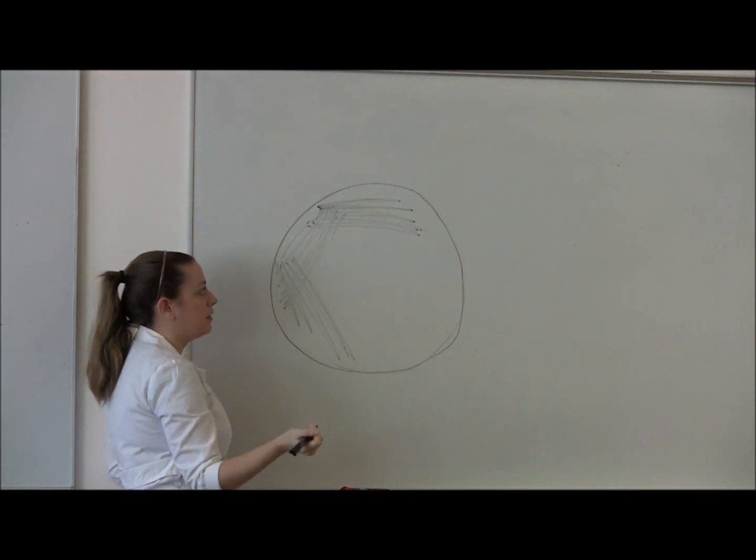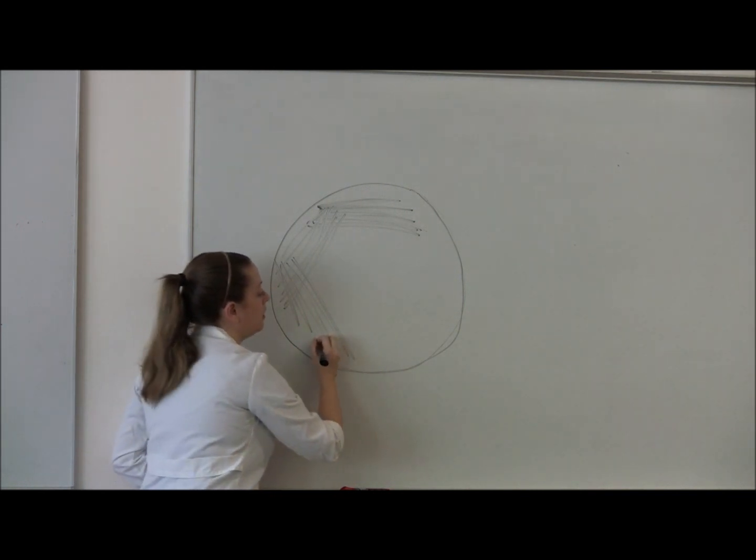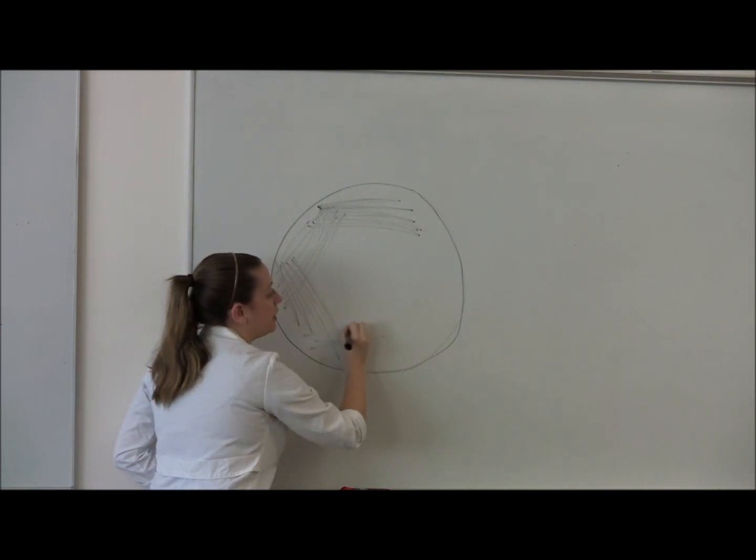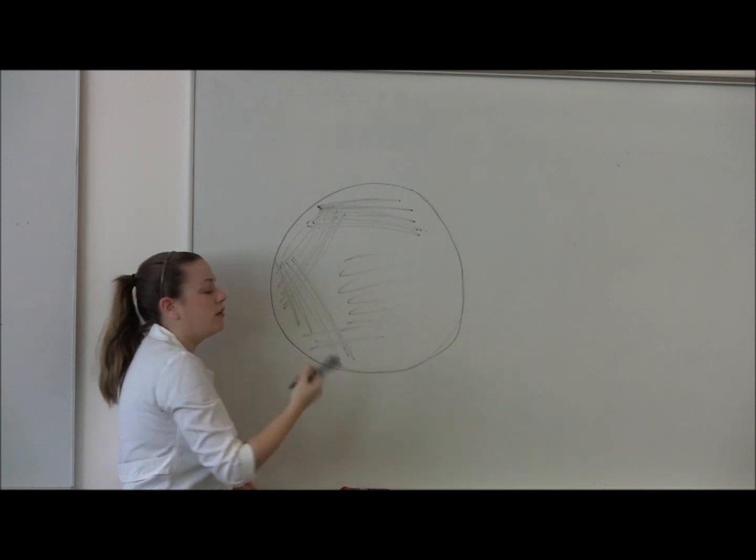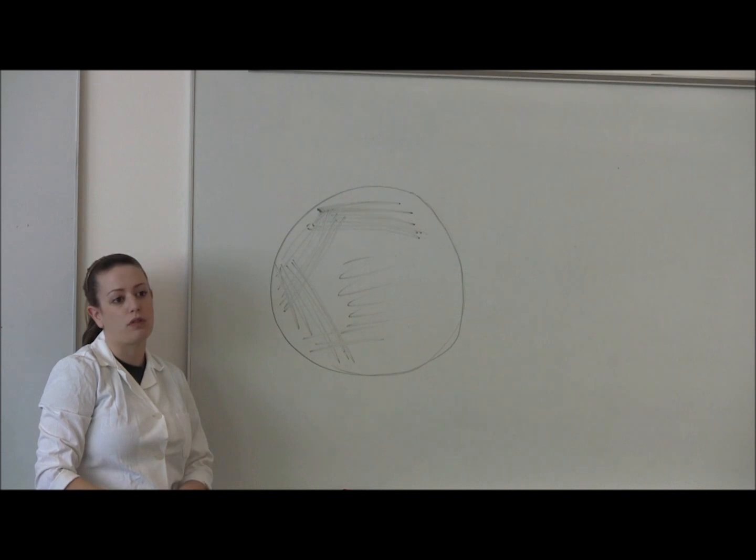Once again, you'll flame your loop, and you'll do your last, fourth quadrant. This is where you want your isolated colonies, and you'll spread this out and hopefully get isolated colonies in the fourth quadrant.